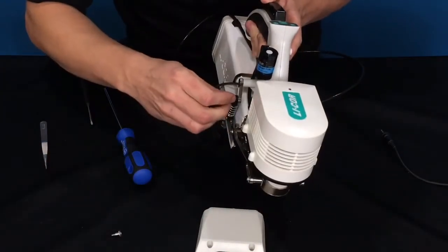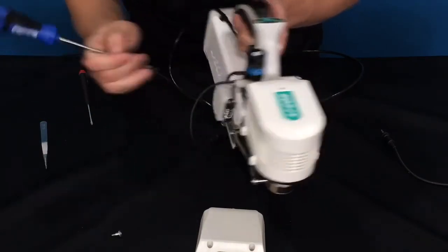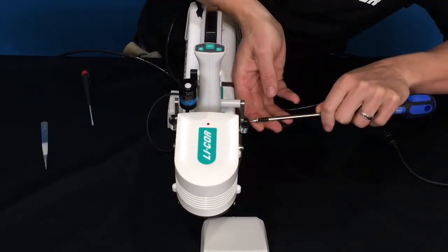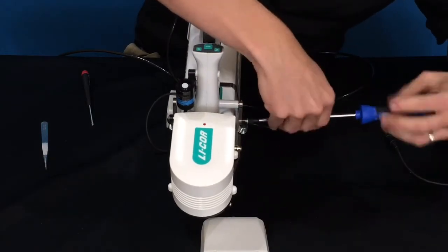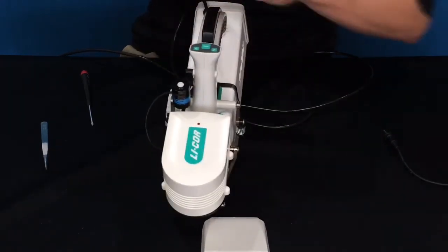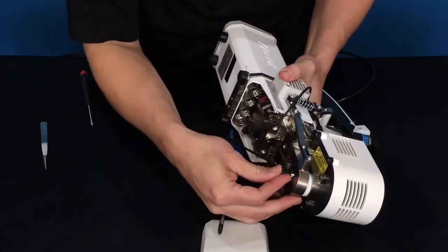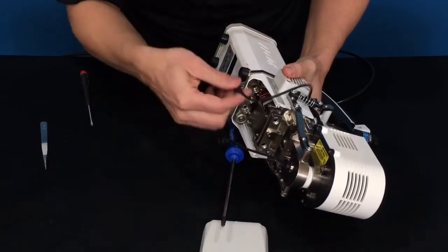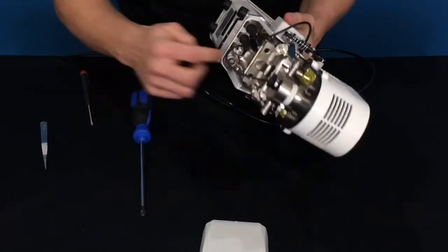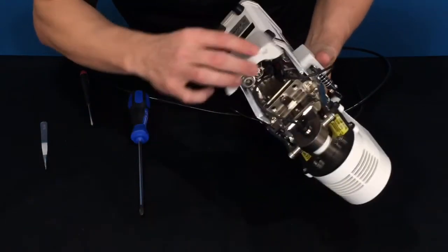Now tighten the two remaining screws in the springs, which again do not need to be excessively tightened. Then put the thermocouple back in — yours may already be installed. You can then plug in your quantum sensor and your thermocouple. With the fluorometer, there won't necessarily be a light source here because it plugs into the console. Then put the skid plate back on.